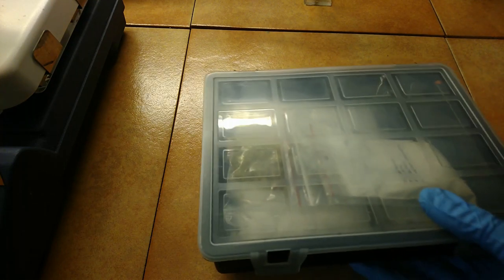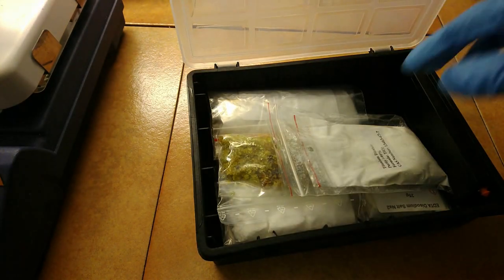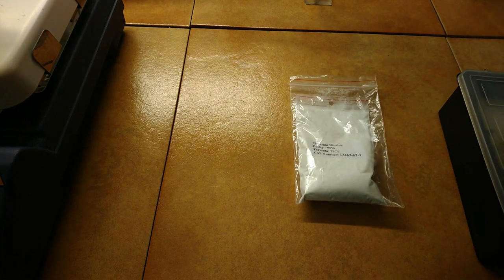Have you bought some titanium dioxide just because it was cheap, only to find out it's pretty unreactive stuff? Have a bag of it sitting around somewhere in your reagent stash gathering dust? Wait no longer, because I've got you covered.